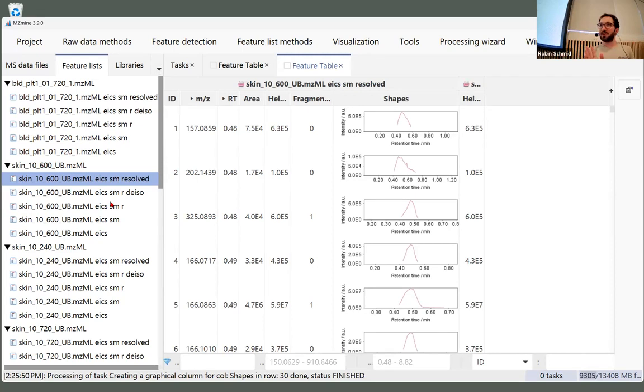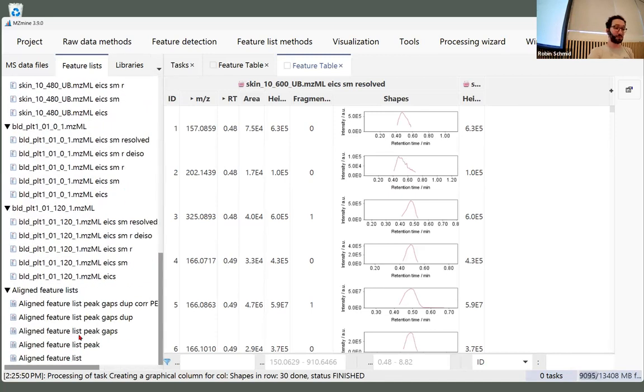But for now, I just want to show you one more thing, how you can look into data. Then we're going to process the 88 files, and then you can have some time to talk to your group members, to talk to your neighbors, and just explore the data set so that you also have some more insights once we go to all the other tools and maybe get some more annotations from series and so on.